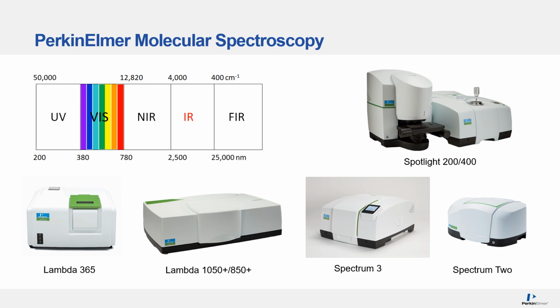The Spectrum 2 is a routine FTIR for measurements in the mid-IR spectral region. For measurements of very small samples or for impurity measurements, the FTIR instruments can be coupled to an infrared microscope, either the Spotlight 200 or the Spotlight 400.